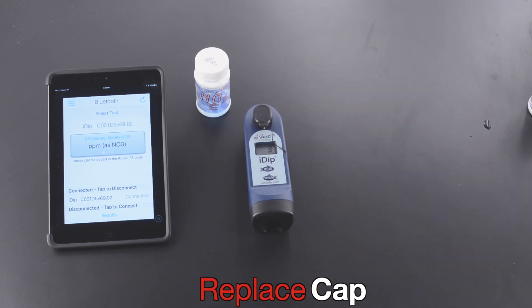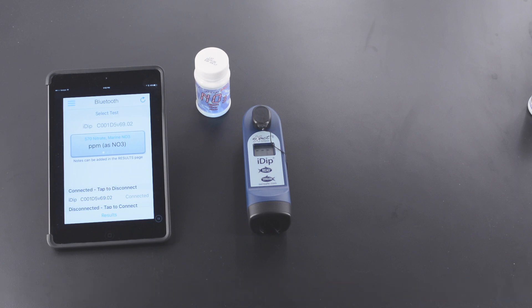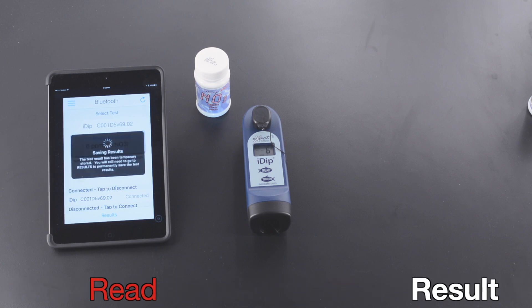Replace Cap. Wait 600 seconds. Read Result.